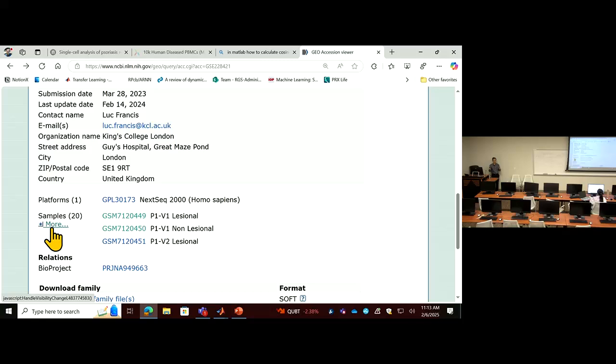It will be a huge data set and requires a large amount of computer memory to hold. For demonstration purposes, I only use the first 2 samples, but the rest will be the same. As long as you label the cell populations and their sources correctly, you should be able to identify which group of cells came from which sample.